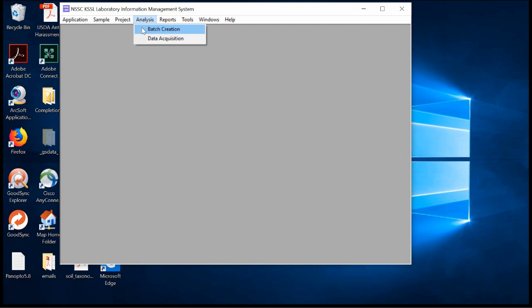They'll see that particular preparations are ready to be analyzed, and certain technicians will create batches of samples that will be analyzed as a whole. Then, later on, when it's assigned to them, technicians will come and literally analyze the batch of samples and enter the data. And that's what this data acquisition window is all about. Typically, you will not go into there.